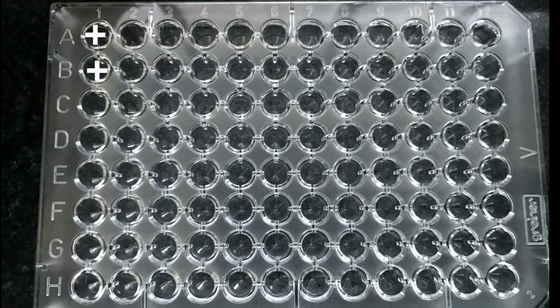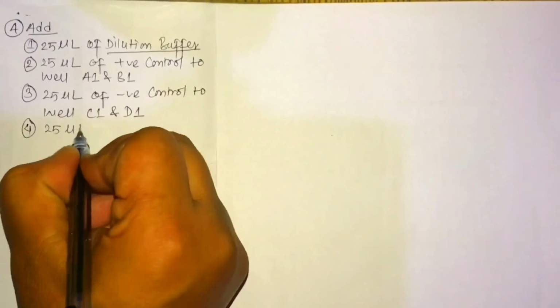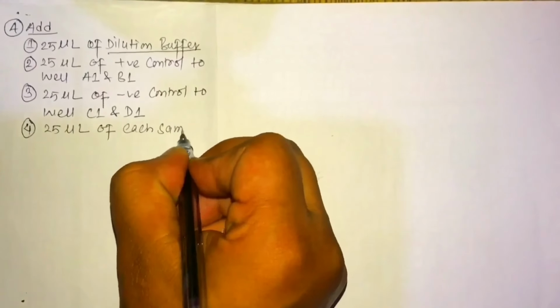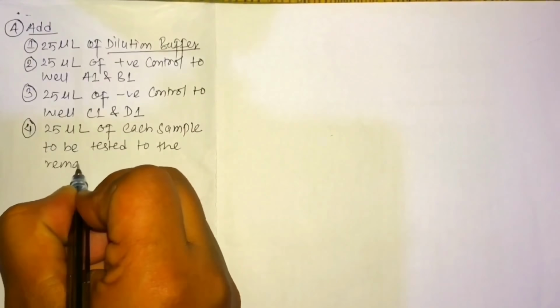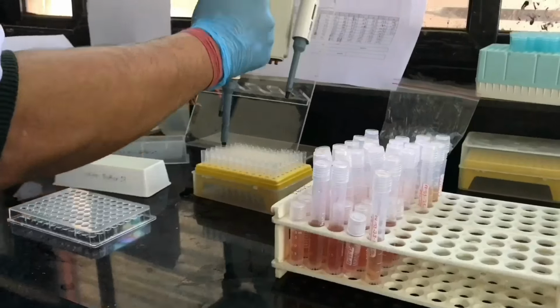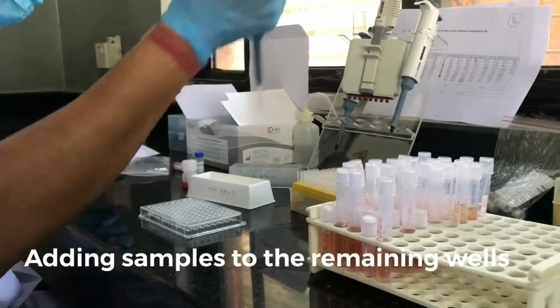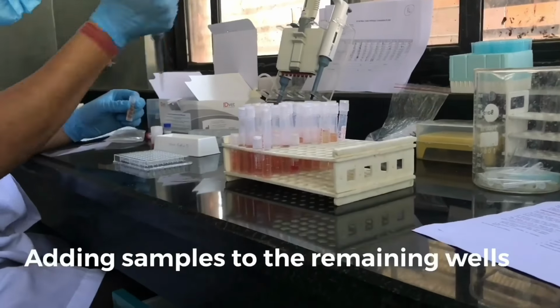Now looking at the 96 well plate, A1 and B1 have positive control and C1 and D1 have negative control, like this. Now we will be adding 25 microliter of each sample to be tested, that is serum, in the remaining wells except these four, the positive and negative controls. So we'll be adding all the samples in the remaining wells.